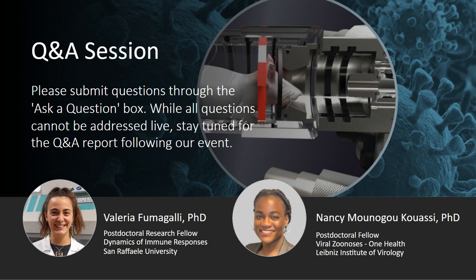All right, very good. Okay, Nancy, considering the whole body plethysmography pulmonary system, which endpoint parameter do you think was the most important or telling? Do you think it was the lung resistance or compliance measured? And if not, do you feel it's needed?